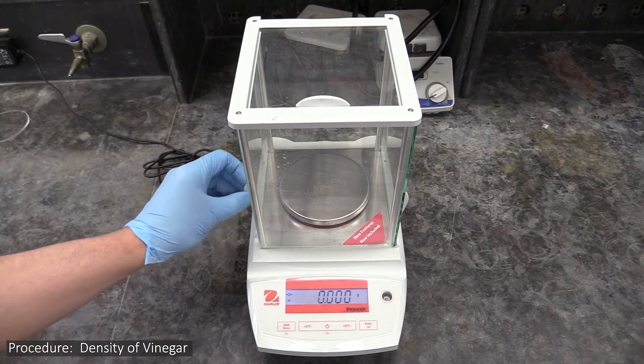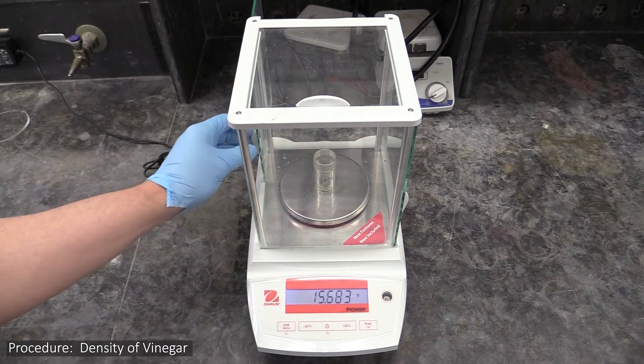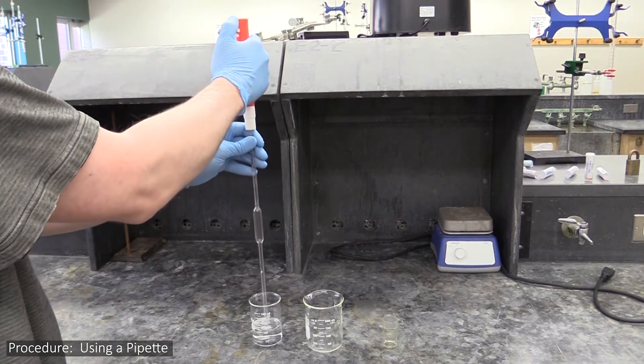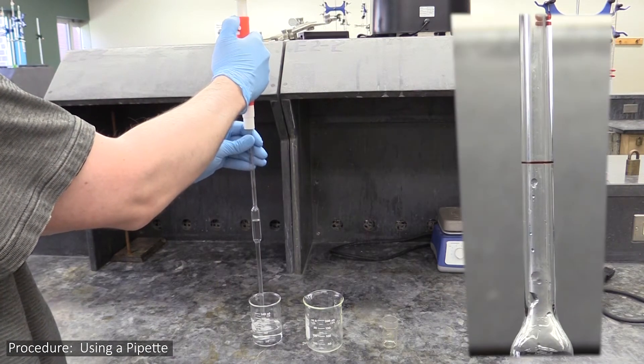Here's how you'll take the data you'll need to calculate the vinegar's density. You will first weigh an empty weigh bottle, then pipette a sample of vinegar into it. To get the vinegar into the pipette, use a pump to draw it up just past the index line.